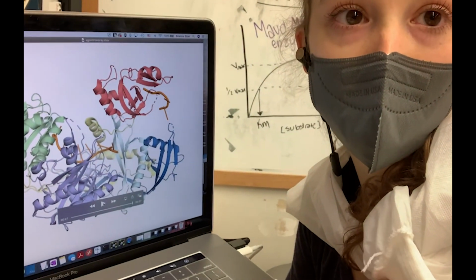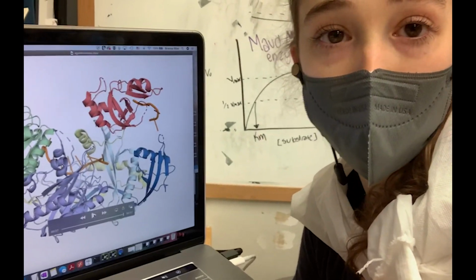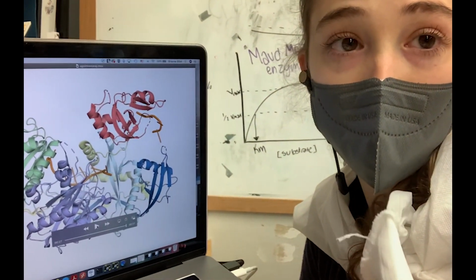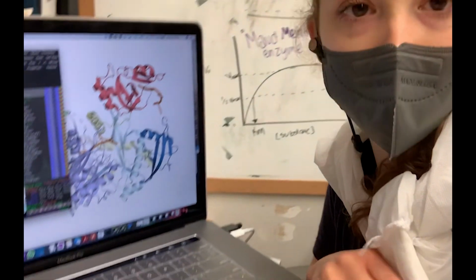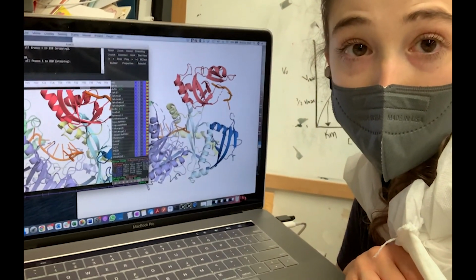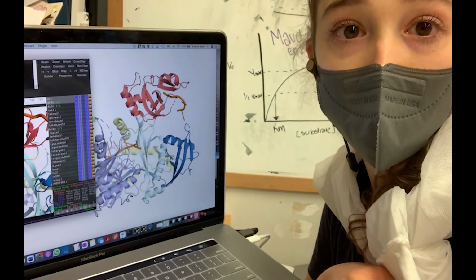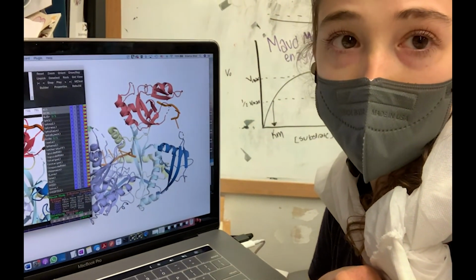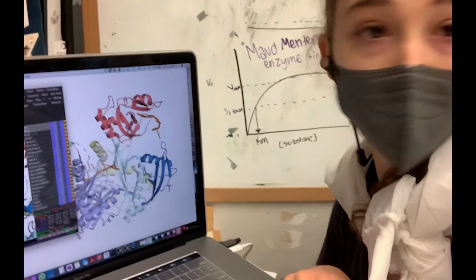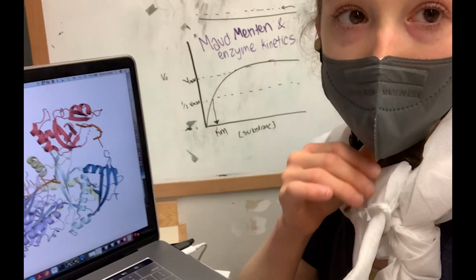So it's a follow-up to yesterday's post where I introduced you to PyMol, which is this free software that you can use. It looks kind of like this. It's a little scary looking, but it's not that bad. And I want to show you how you can just play around and make a simple movie and align structures and that sort of thing. So look at yesterday's post if you're not familiar with PyMol yet.